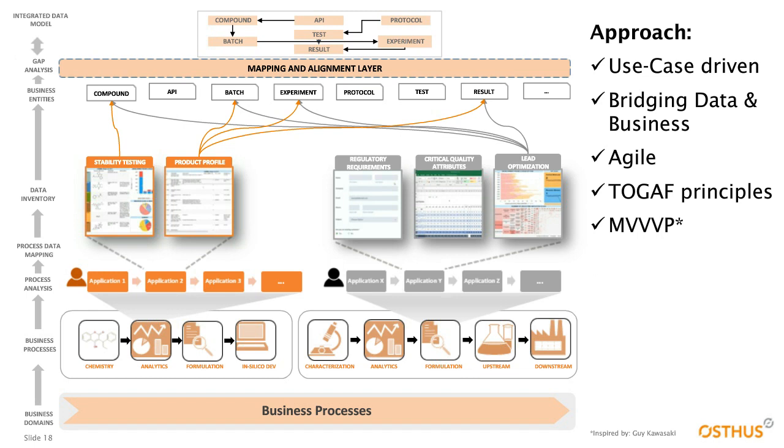And this as-is understanding is very important in order to not create a project for which then there is no data available. But on the other hand, you have specific questions that you want to answer. Like, for example, get me all experiments for a certain material or for a certain substance. Or clarify a question, how similar are certain batches. And this is the top-down approach, where you start with an integrated data model that is able to answer these questions.